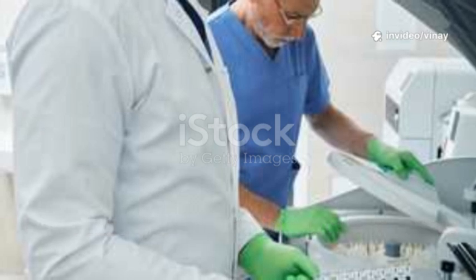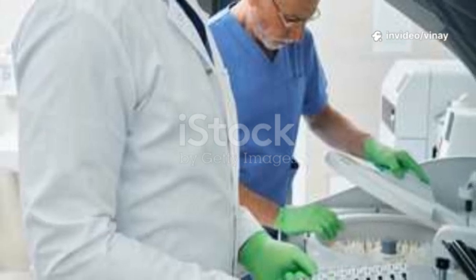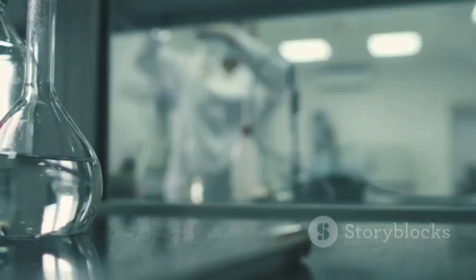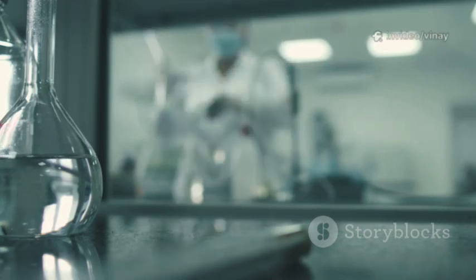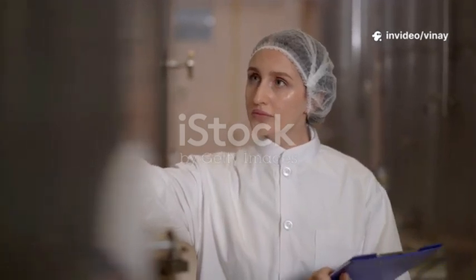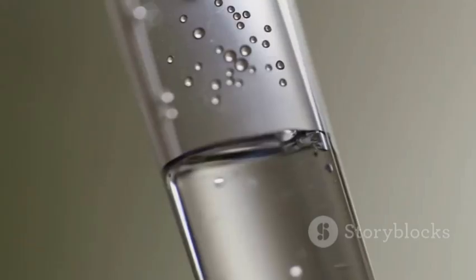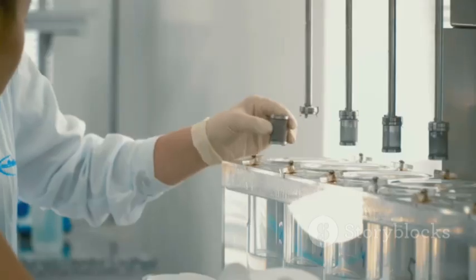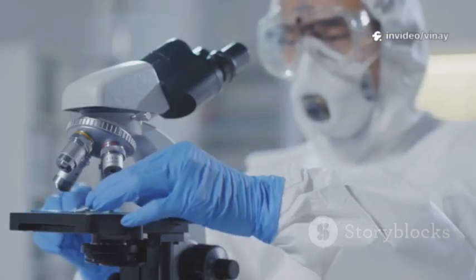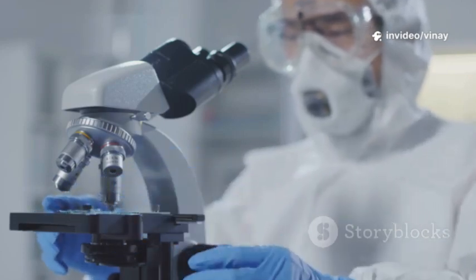As we've seen, filter integrity testing is much more than just a routine check. It's a fundamental pillar of modern medicine safety. It's a practical application of physics and chemistry that stands as a guardian between the manufacturing process and the patient. Every time one of these tests is performed, it's a deliberate act of ensuring quality and protecting health. From the simple elegance of the bubble point test to the precise measurement of the forward flow test, each method provides a unique window into the microscopic world of the filter, confirming that it is whole, sound, and ready to perform its critical duty of sterilization.